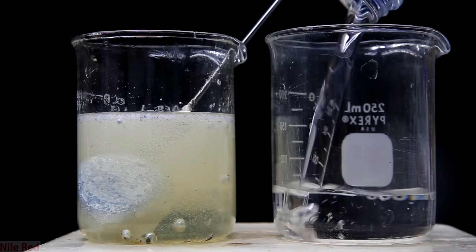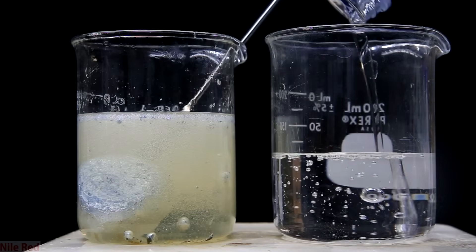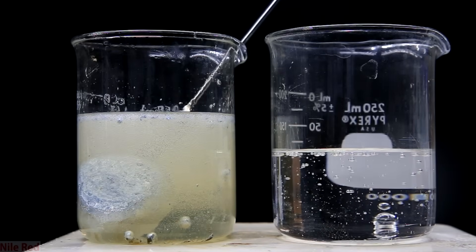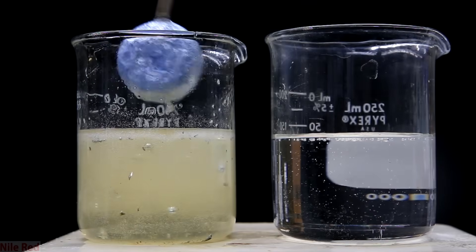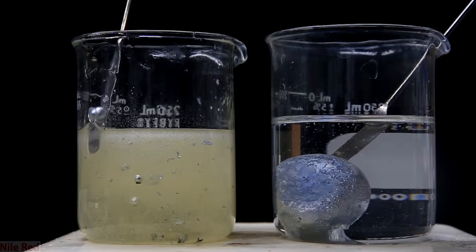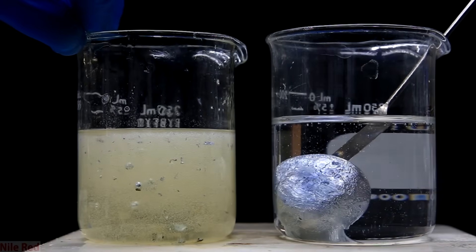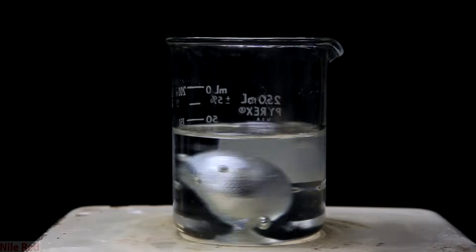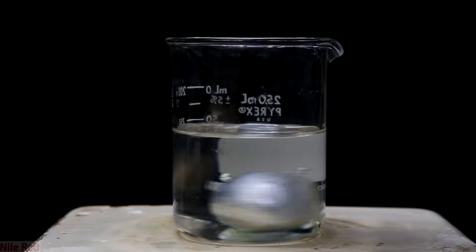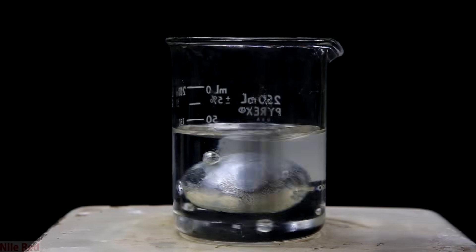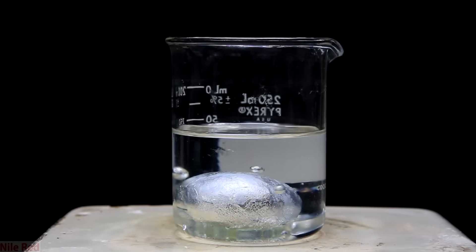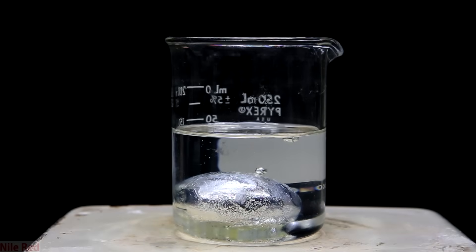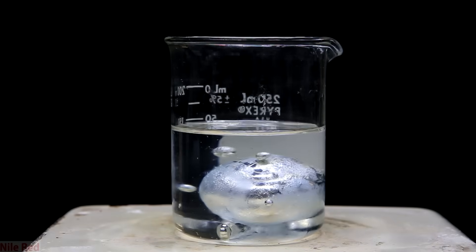And now for one final step of cleaning it we pour some more mineral oil into another beaker. The large potassium blob and as many of the smaller potassium pieces that I could get were also transferred. So just like before we turn up the heat and we melt the potassium again. This time though I didn't add any isopropanol because I figured that the amount of oxides on the surface were probably super low.